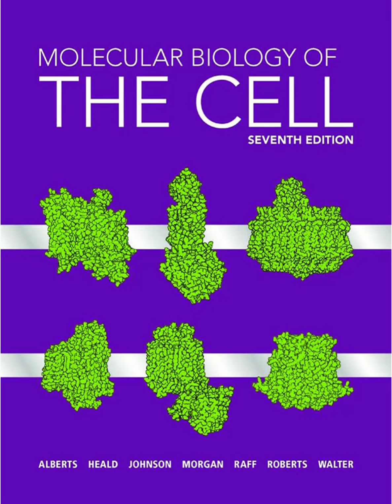One more light technique. What if you want to see single molecules right at the cell surface, but the background fluorescence from inside the cell is drowning them out? For that, there's TIRF microscopy, total internal reflection fluorescence. TIRF. How does that eliminate background? It uses a neat optical trick based on how light behaves at an interface, like between the glass cover slip and the watery cell medium. You shine the excitation laser beam through the objective lens at a very specific shallow angle so that it hits the glass-water interface at greater than the critical angle.